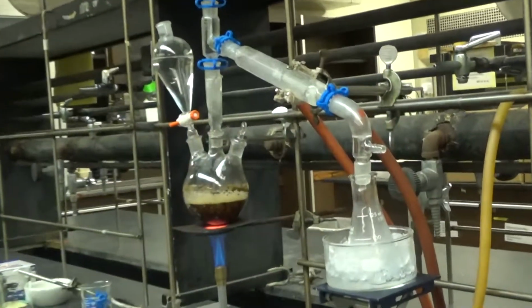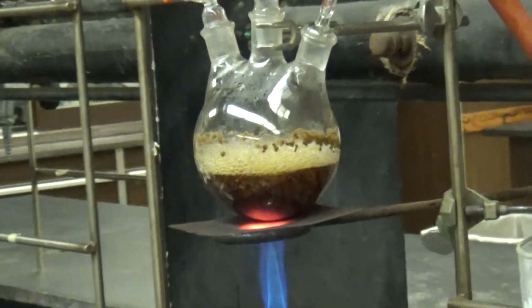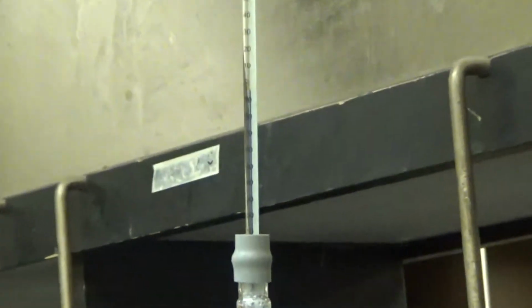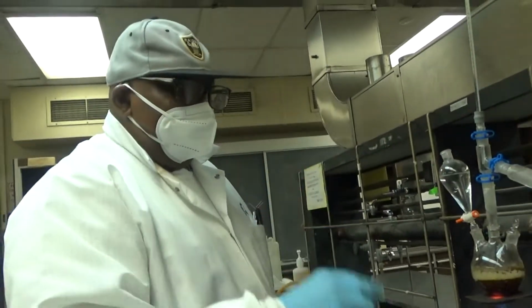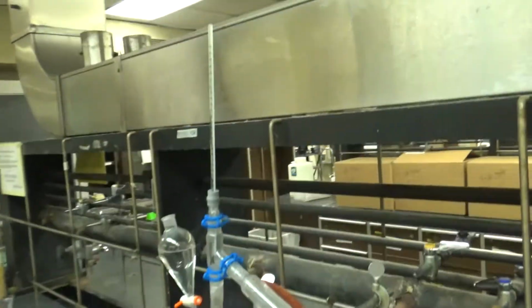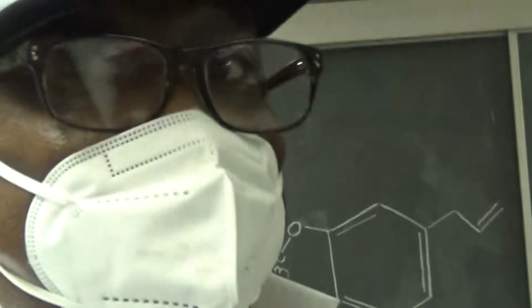It's written very well. See, collection here. The experiment's proceeding, it's still boiling, it's still going up. We're going to collect 75 milliliters of co-distillate, because what you have here is a co-distillate of water and eugenol. What's the temperature now? 96. Cool. It doesn't really go higher than that. It maxes out at about 100.